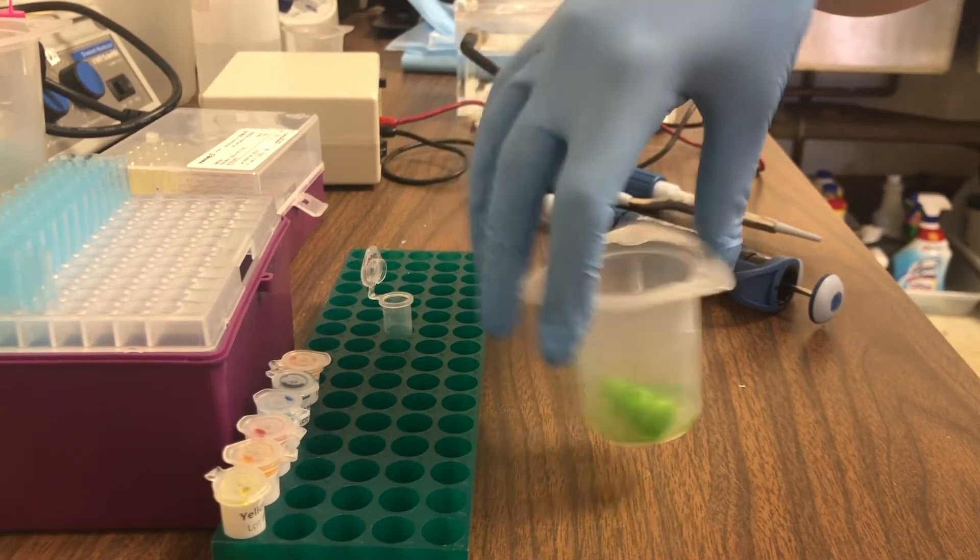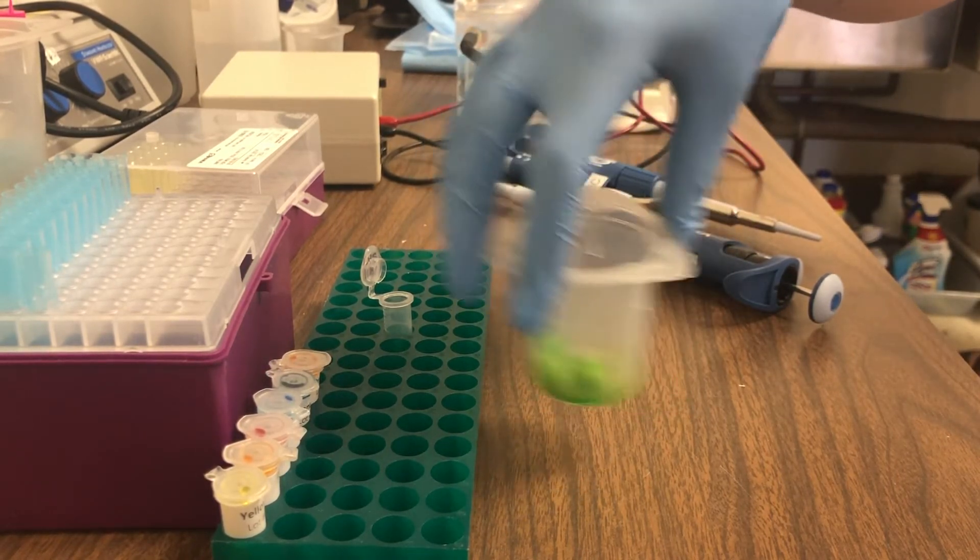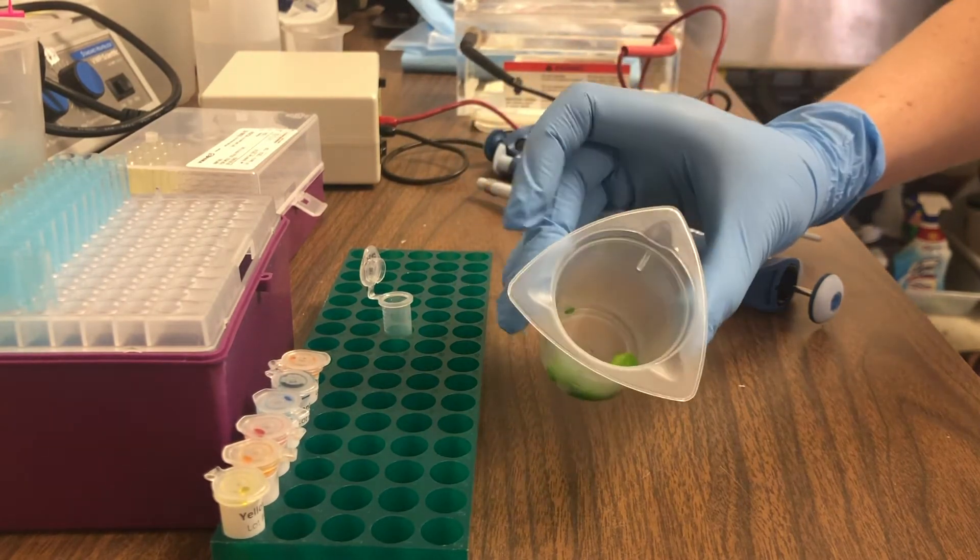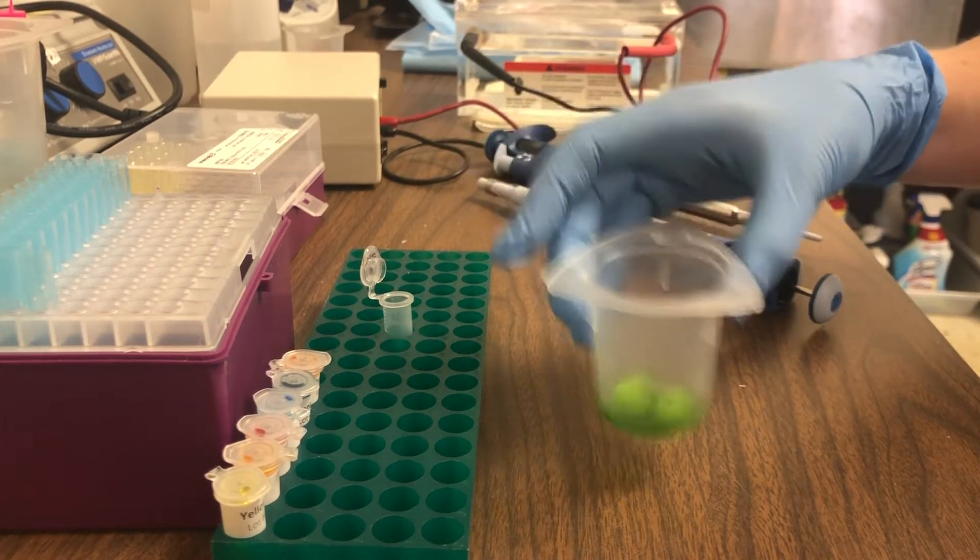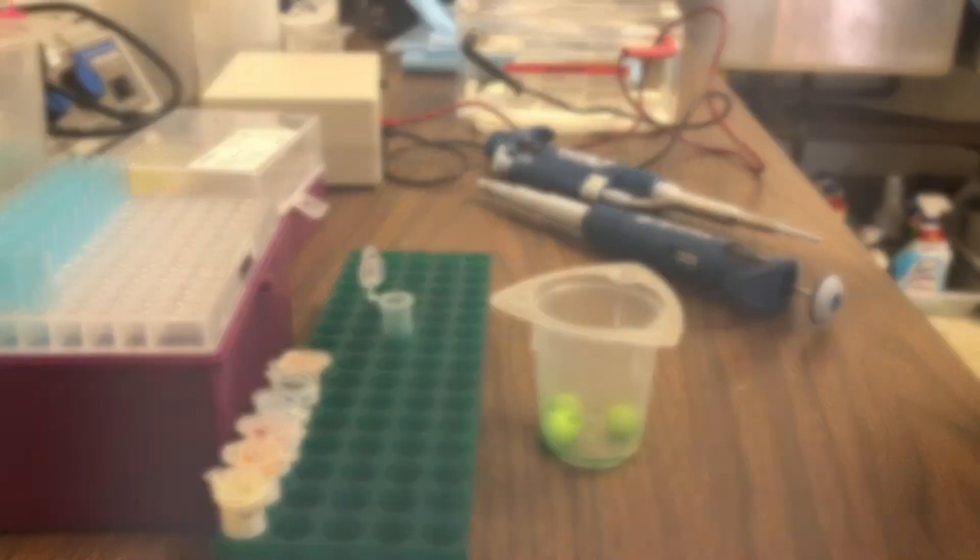What the TAE does is it removes whatever molecule is on the outside of that Skittle and into the TAE. So you'll see here now that most of the color is off the outside of the Skittles and is in the liquid at the bottom of the beaker.